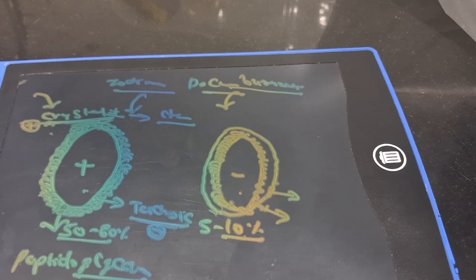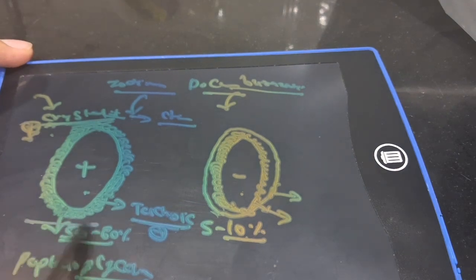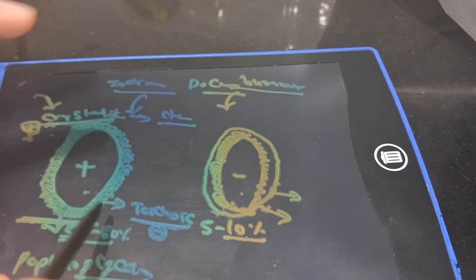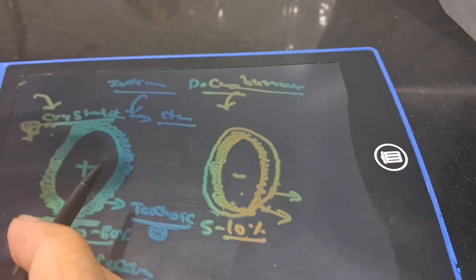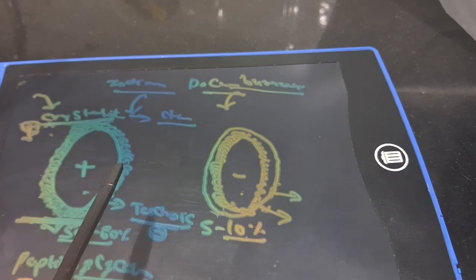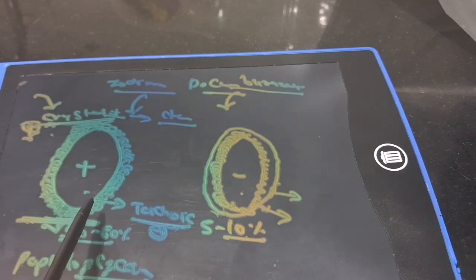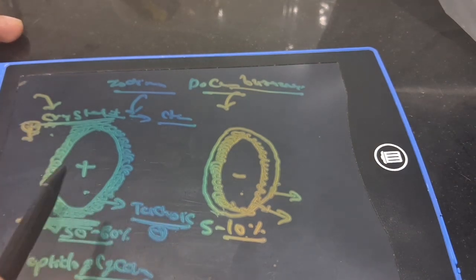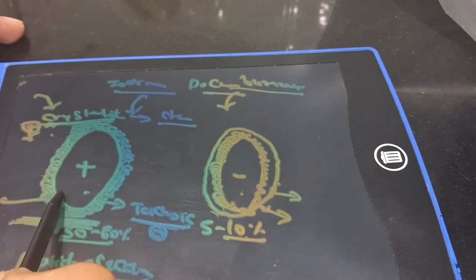it is very effective. So when you use acetone for the gram positive bacteria, because of the thickness of the peptidoglycan layers, it won't be able to dissolve the whole thickness of the peptidoglycan layers. So the effect of acetone on the gram positive bacteria will be zero. Acetone will not be able to impact anything in gram positive because of the thick peptidoglycan layers. So after the decolorization, you will see that gram positive bacteria are still looking purple.